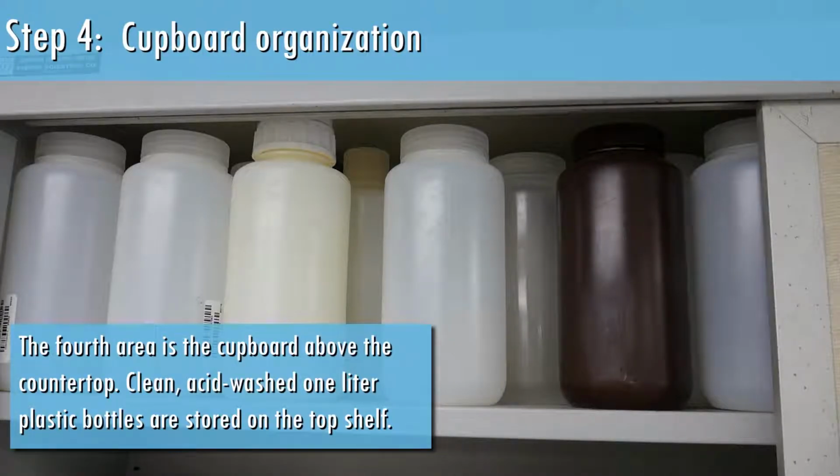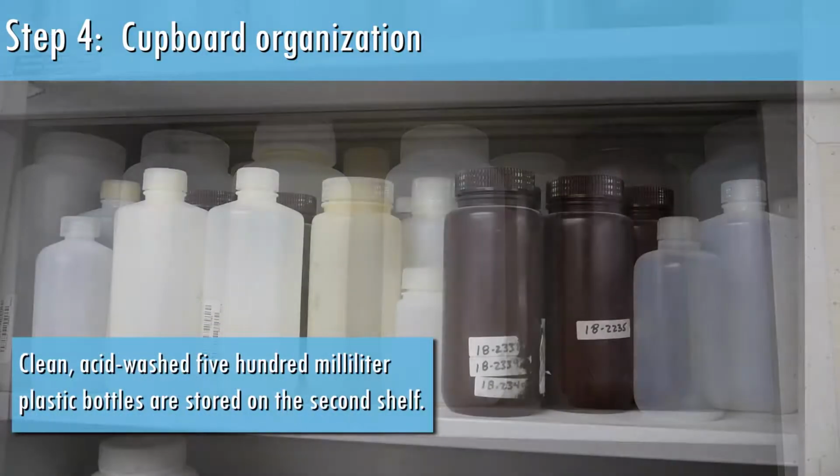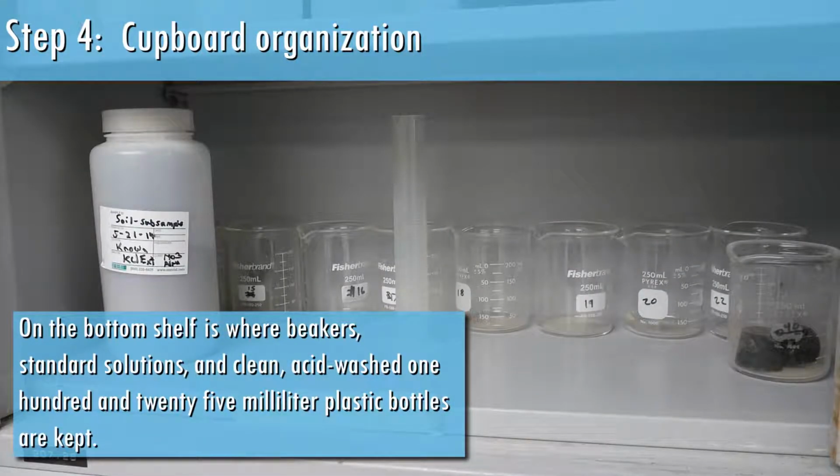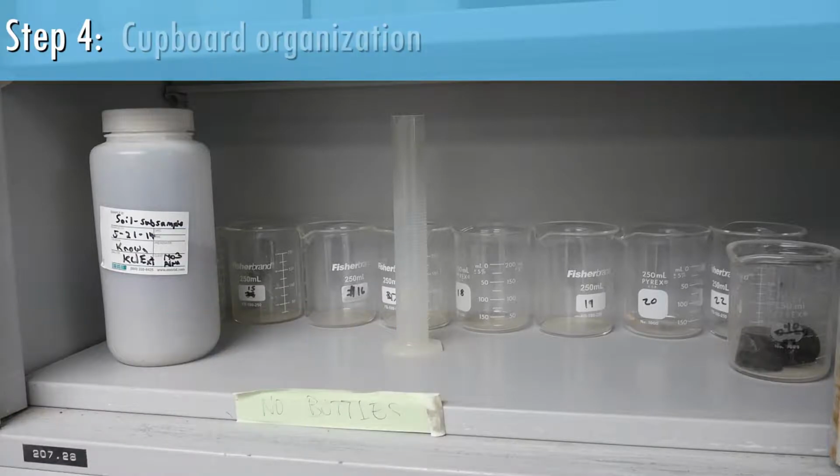The fourth area is the cupboard above the countertop. Clean, acid-washed 1-liter plastic bottles are stored on the top shelf. Clean, acid-washed 500 milliliter plastic bottles are located on the second shelf. On the bottom shelf is where beakers, standard solutions, and clean, acid-washed 125 milliliter plastic bottles are kept.